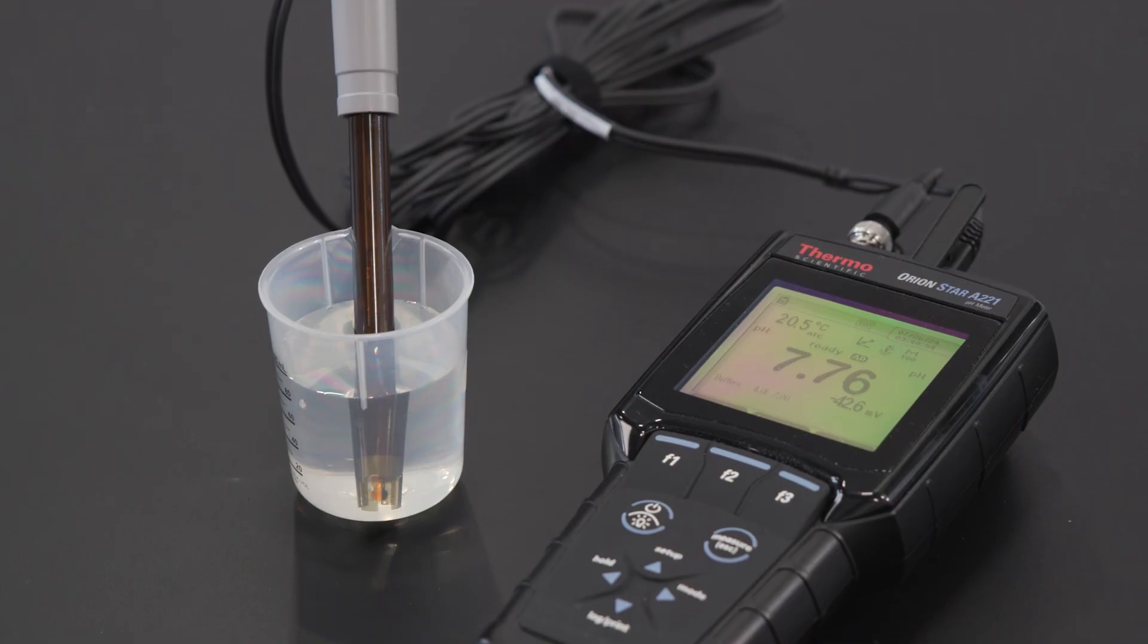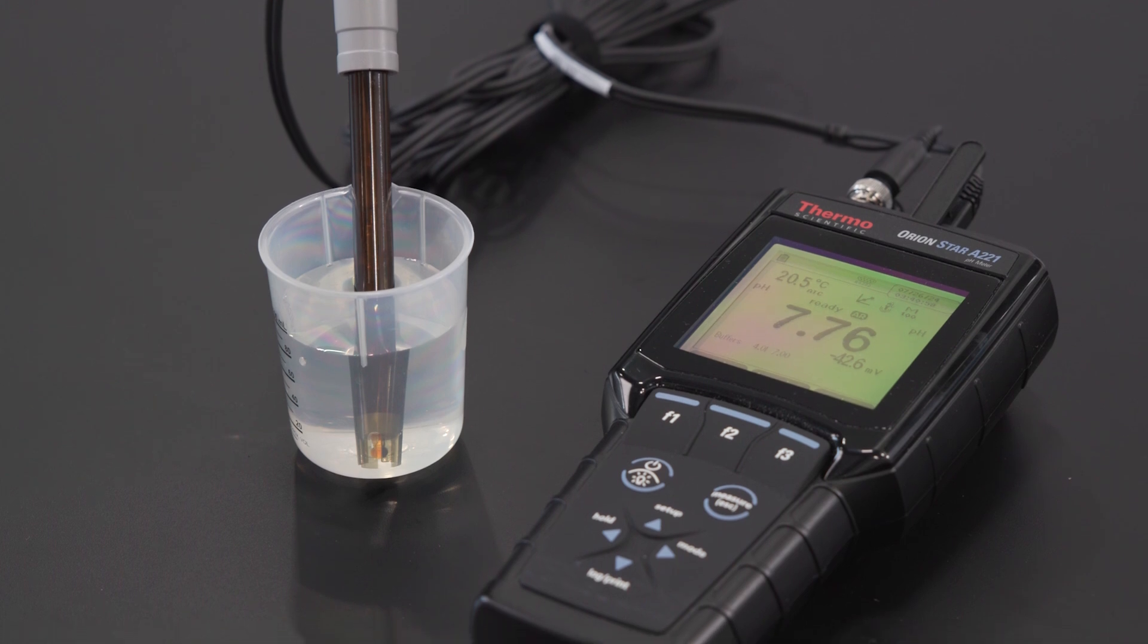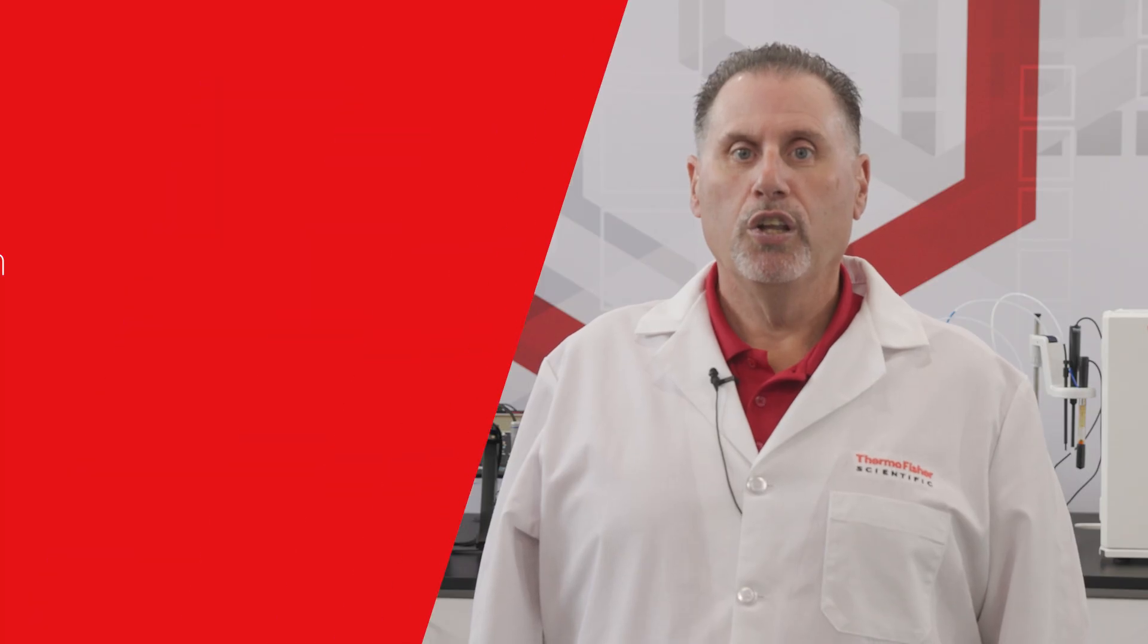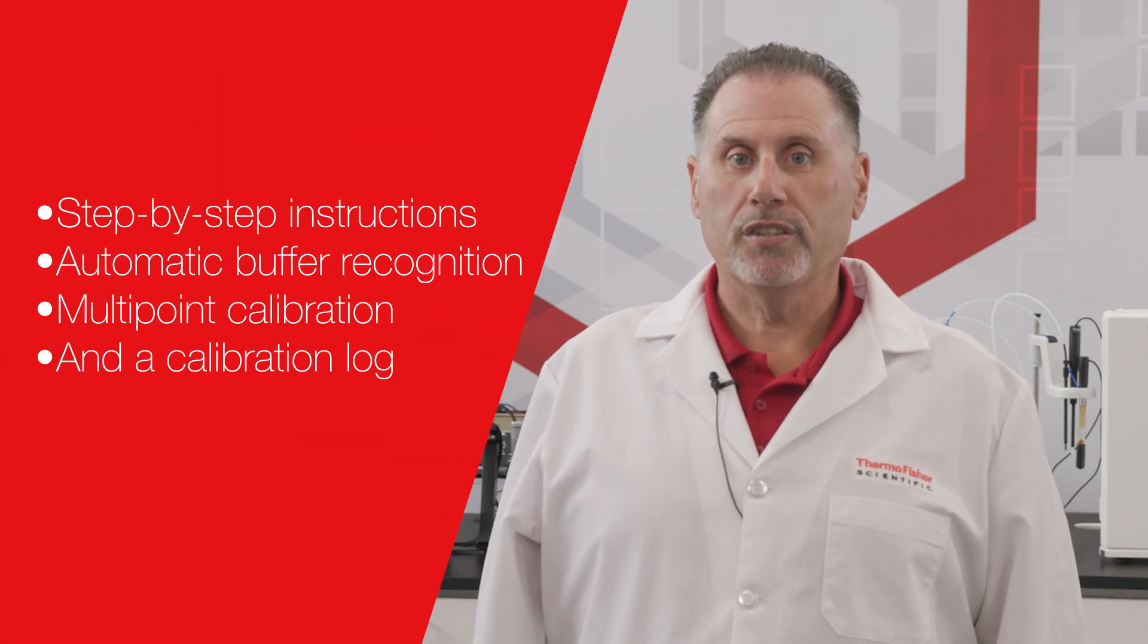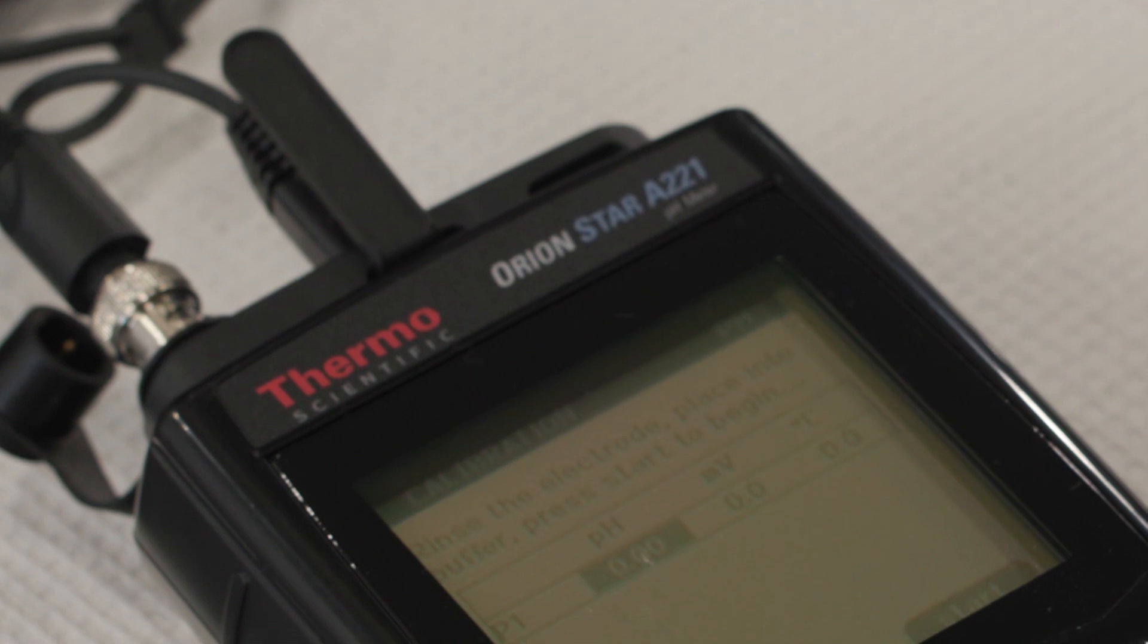Now let's talk about calibration. Every pH meter needs to be calibrated regularly. Choose a meter that is fast, easy to calibrate, and provides accurate results. Look for features like step-by-step instructions, automatic buffer recognition, multipoint calibration, and a calibration log. Let's discuss each of these features further.